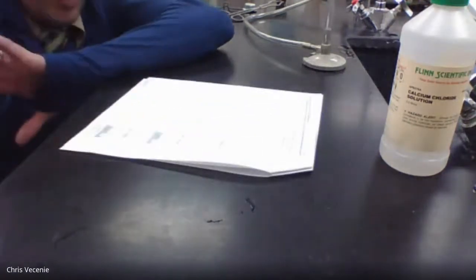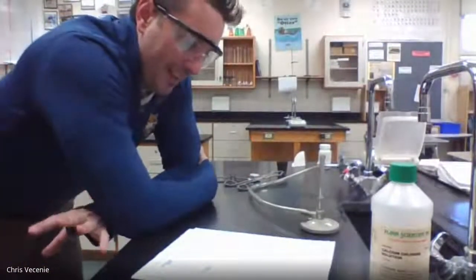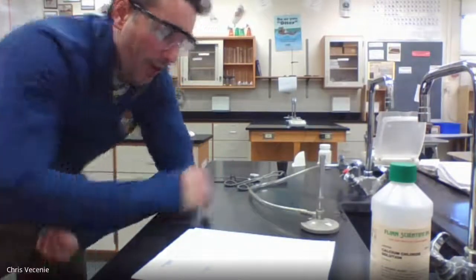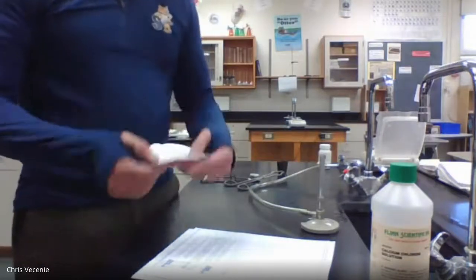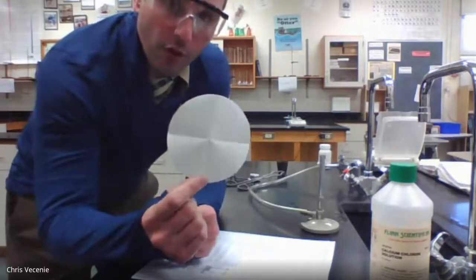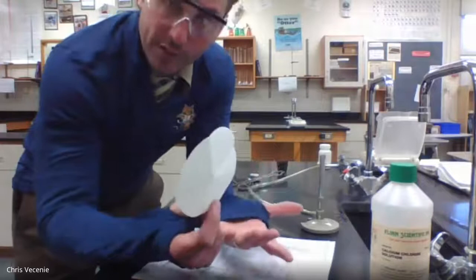In the meantime, what it tells us to do is to go and get a piece of filter paper. And it says weigh the filter paper and record the mass. So I'm getting a piece of filter paper, but it's important that I know what this weighs all by itself because I need to see how much heavier it gets when the precipitate's on it.